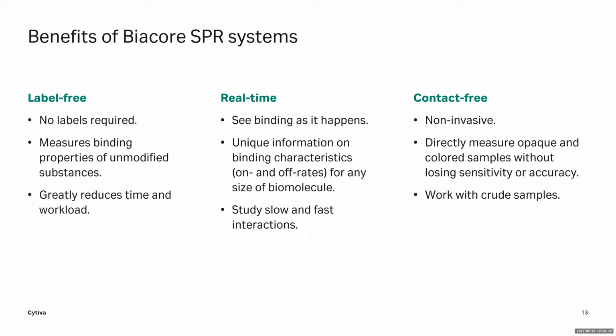I had a colleague many years ago, a research group was interested in studying peanut allergens. So they set up a test with Reese's peanut butter cups. Took them, homogenized them, filtered them, so you had a nice chocolatey, peanut buttery extract, passed it over a chip coated with peanut allergen antibodies. And yes, as you might expect, there are peanut allergens in Reese's peanut butter cups. Not really a surprise there, but that's just an example of how complex a mixture can be to still give you acceptable Biacore results.